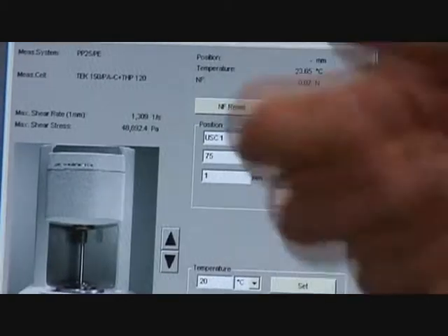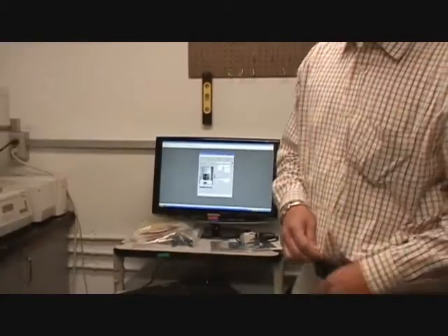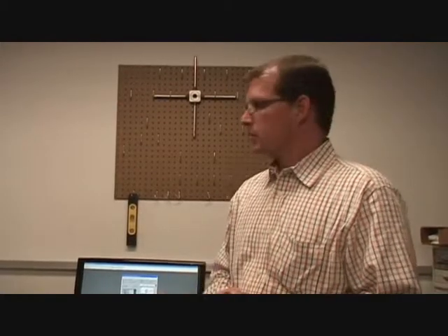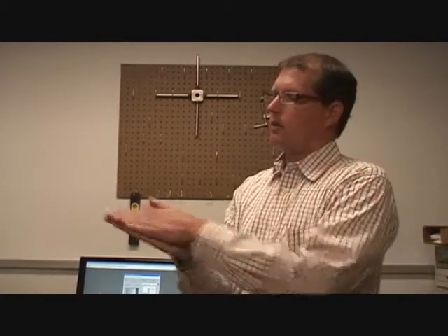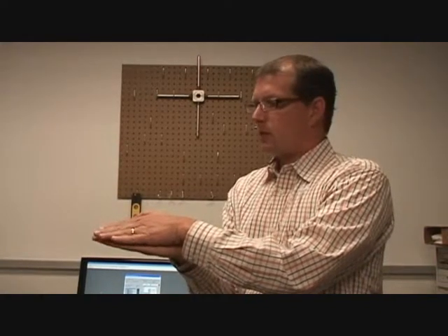Let's go through — it's always fun to try and run something, to give you an idea of how you would just do a run. You know what an amplitude sweep is? So we'll take our material and what we're going to say is that we're going to look at this two-plate model. We're going to start at really small deformations and then move to bigger and bigger ones — just check the amplitude.